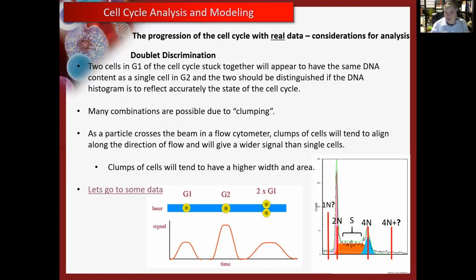A bunch of different things can be stuck together. But what we do with our data is that we can use the different parameters in our data. You may have seen side scatter A, H, and W and wondered what the heck were those? Why don't we just have one side scatter parameter, or one parameter for everything?